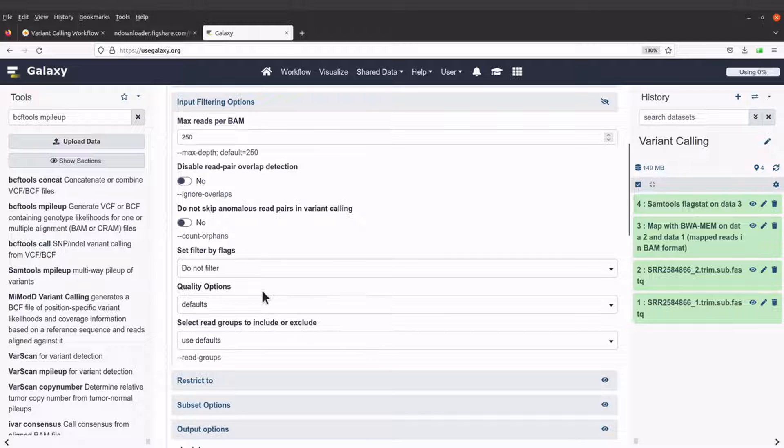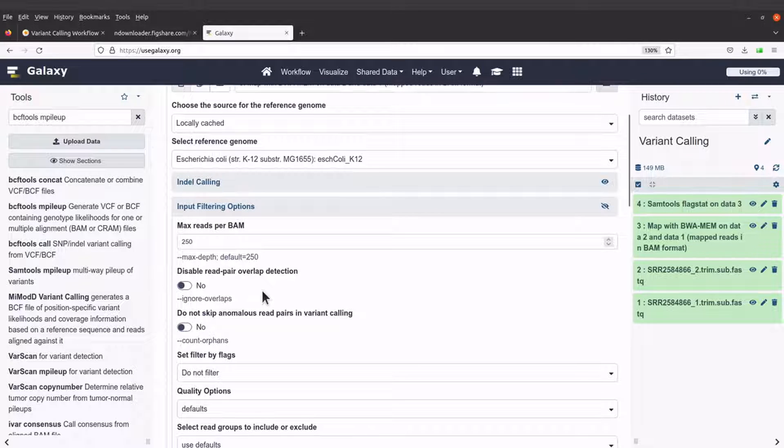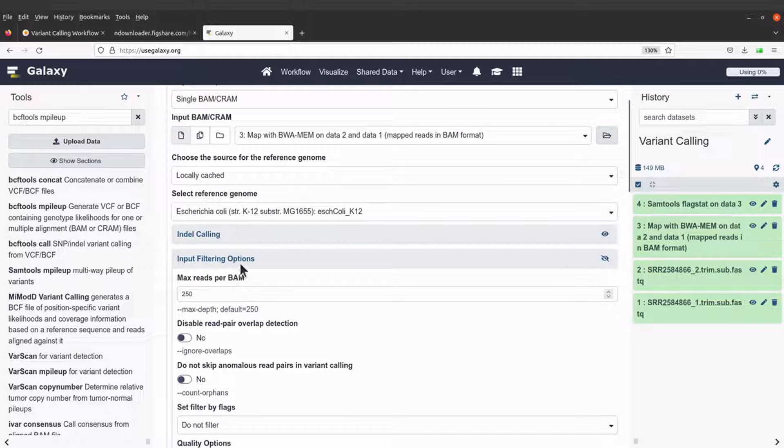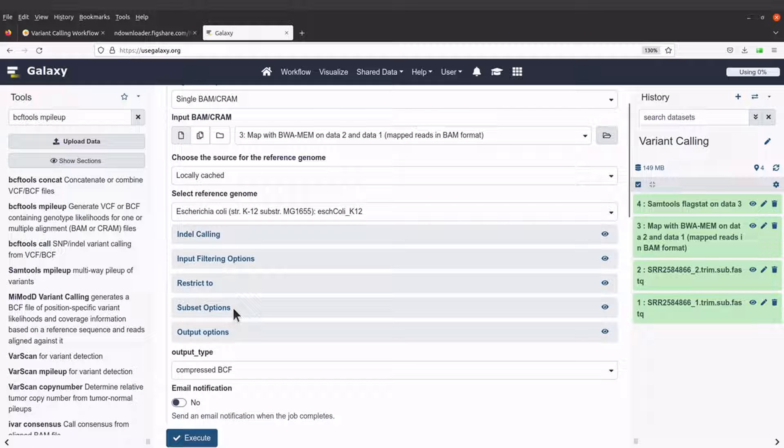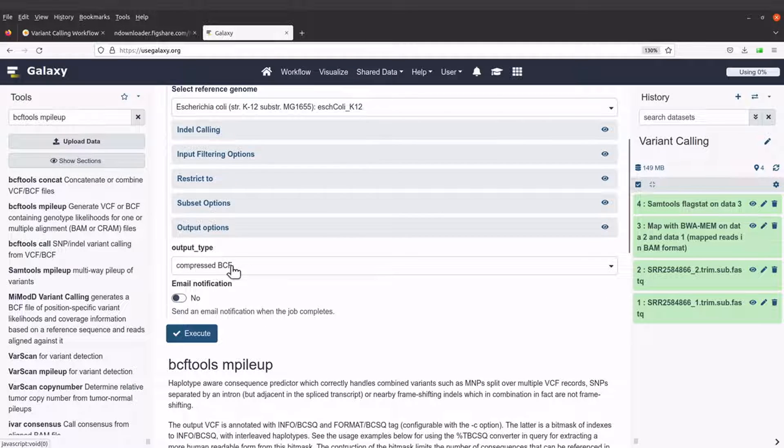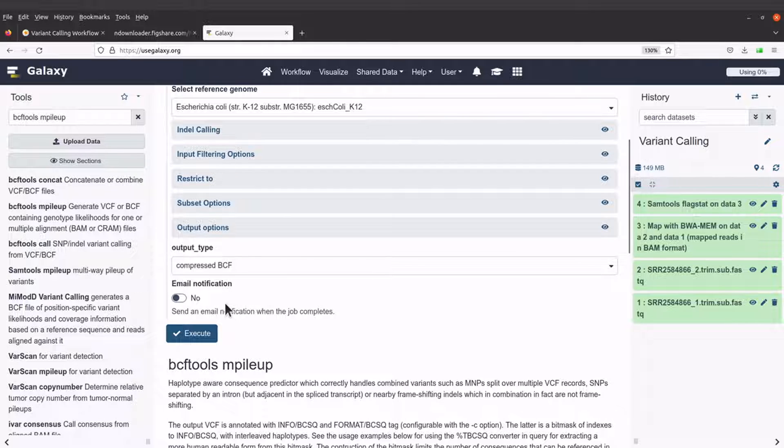Okay, so if you want to be stringent, you can change some of these options here. But we will leave everything. We want to use the default settings. Output type. We will maintain the compressed BCF. And that's it. So let's execute this command.